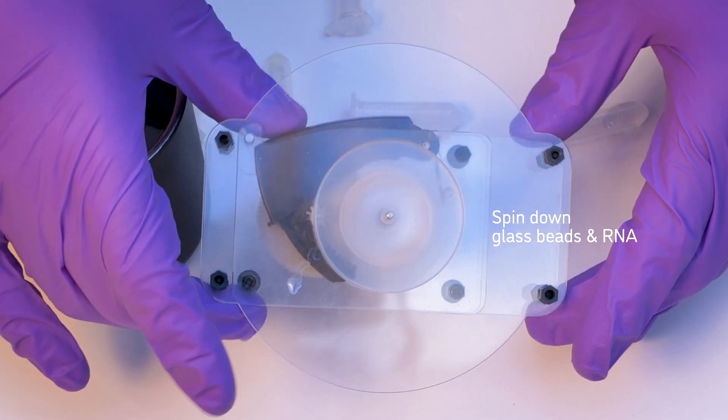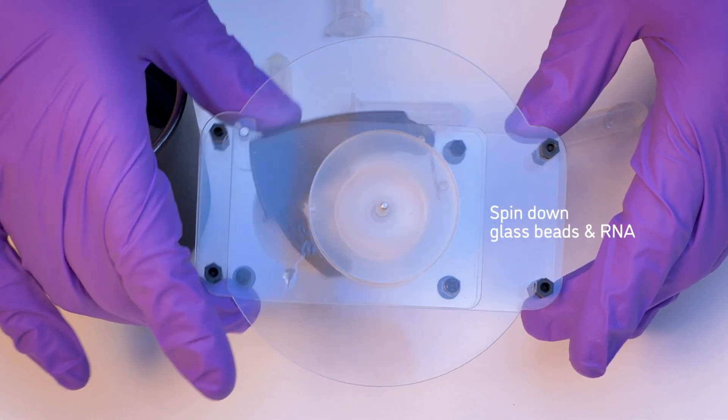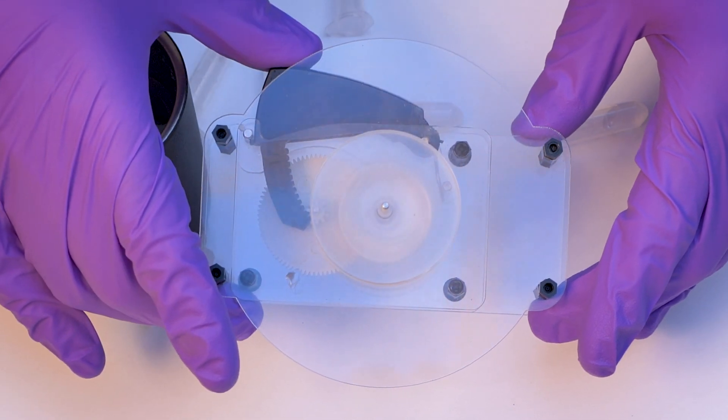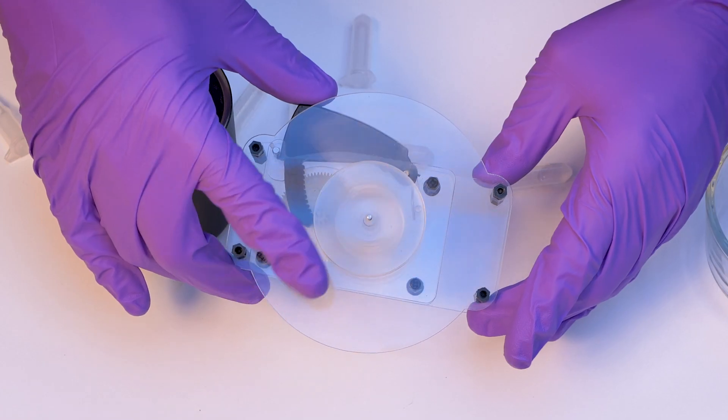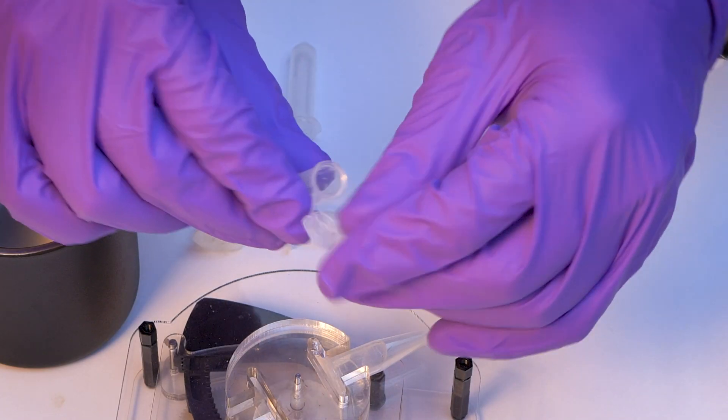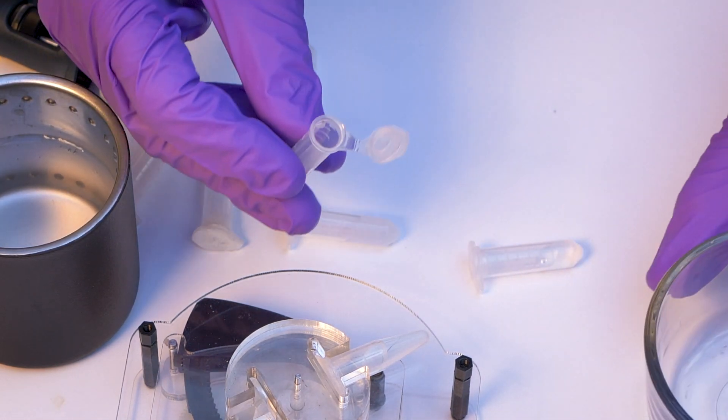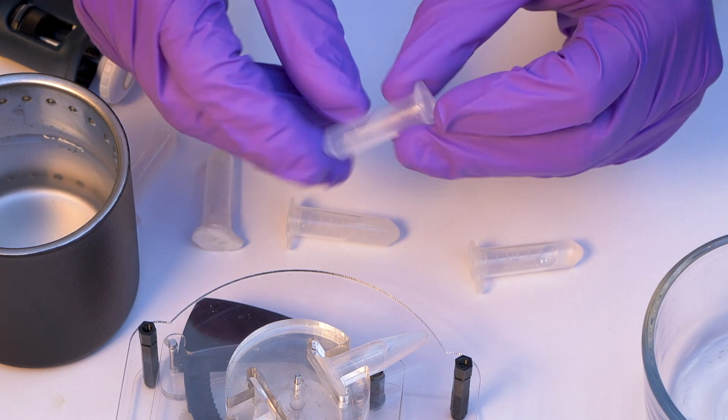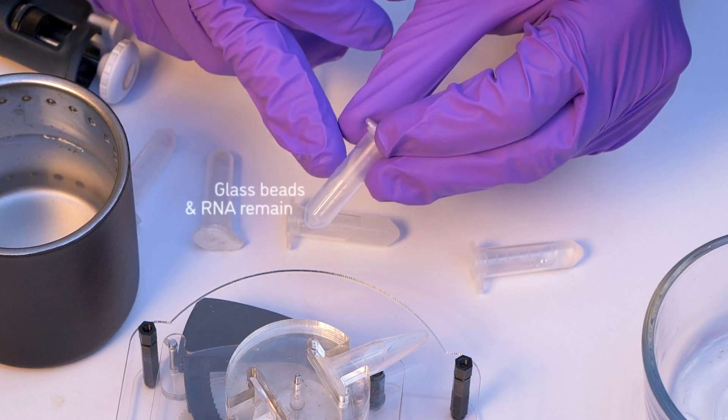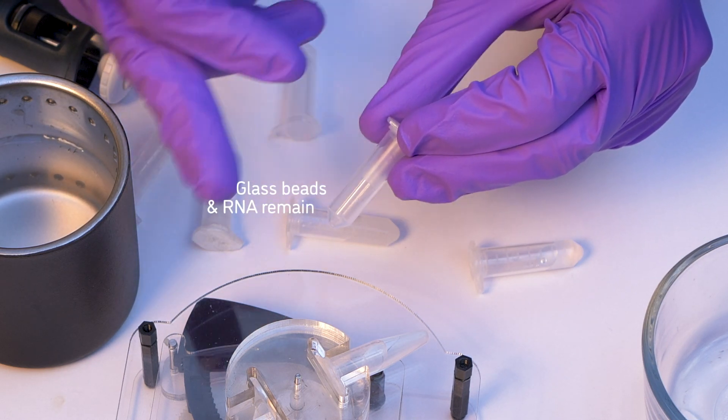And now what we want to do is spin this down so the glass beads will be at the bottom. So at this point, we could simply pour this off. And so now what we have is just the glass beads, which will have the viral RNA, if present, and they're stuck to the bottom of the tube.